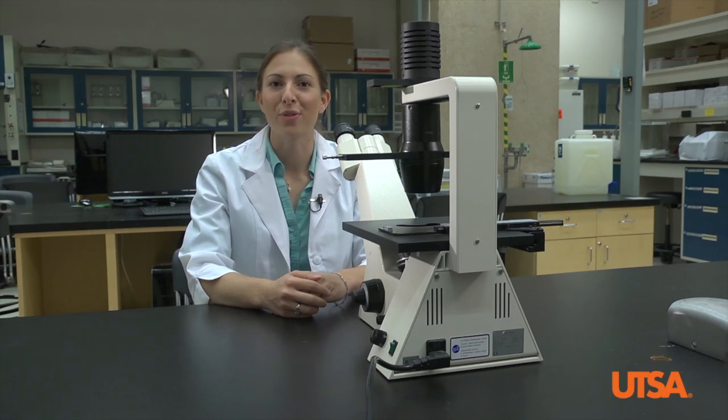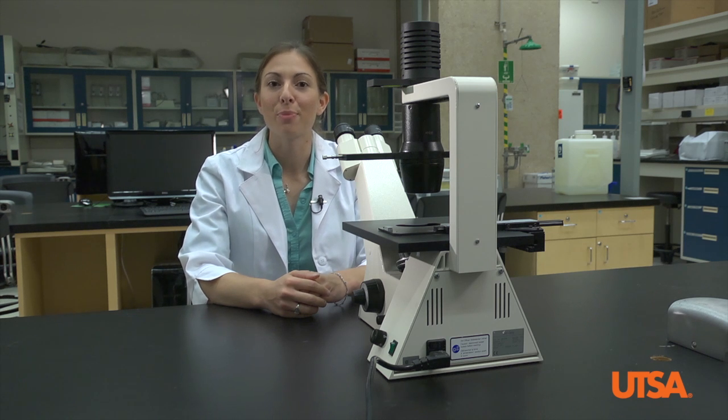In this video we'll review how to use an inverted microscope. First let's go over the basic parts you'll be using.